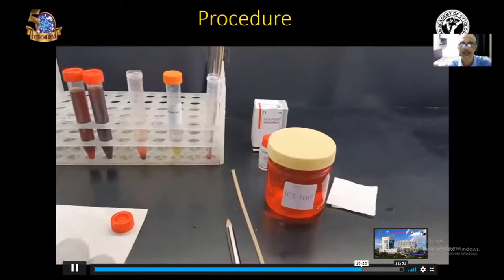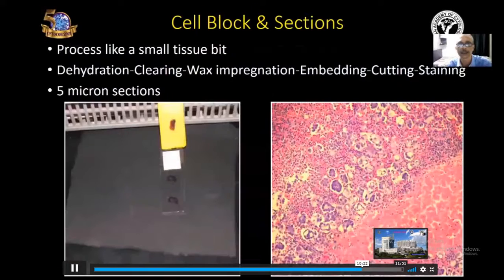So, this is the procedure and at the end of the procedure, this cell block will go for processing as a small tissue biopsy and this block will go through dehydration, clearing, paraffin impregnation, embedding, cutting and staining.